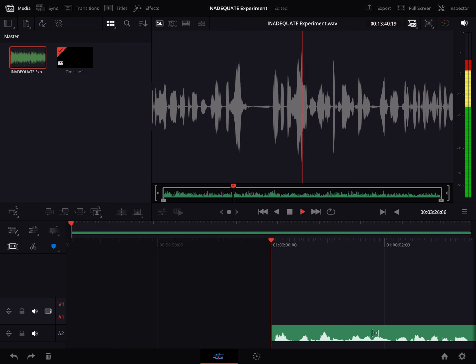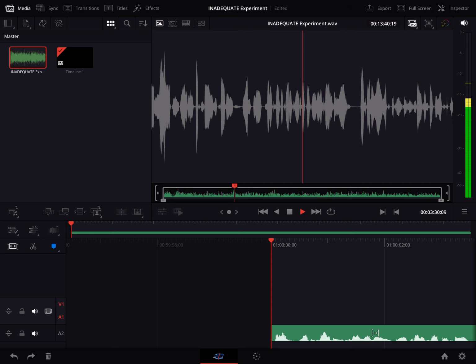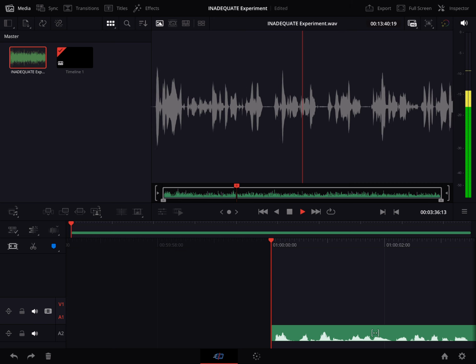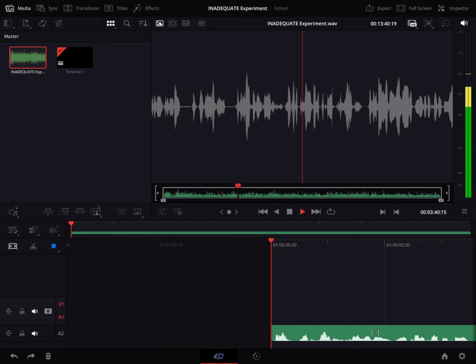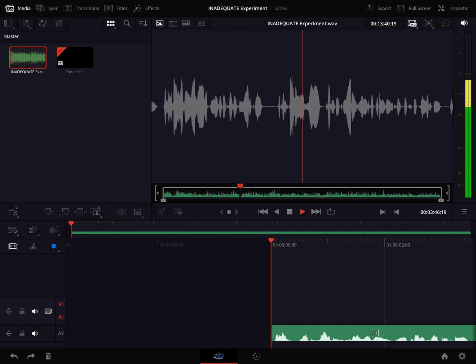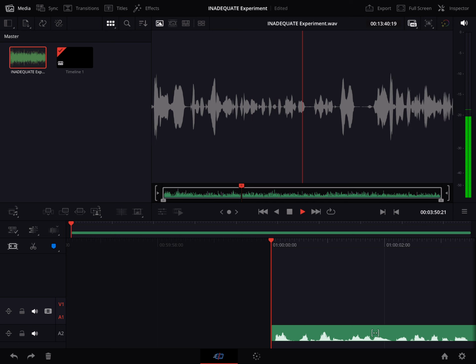But I bet those maps, or spectra as you call them, must be pretty complicated to interpret, right? Well, they can be, yeah. That's where the real expertise comes in. Scientists have to look at the position, intensity, and shape of each signal to decipher those connections. So it's like a code they have to crack. Exactly. This is starting to make me wonder if maybe they called it INADEQUATE because finding those rare carbon-13 atoms and then interpreting those complex spectra must be a real headache.